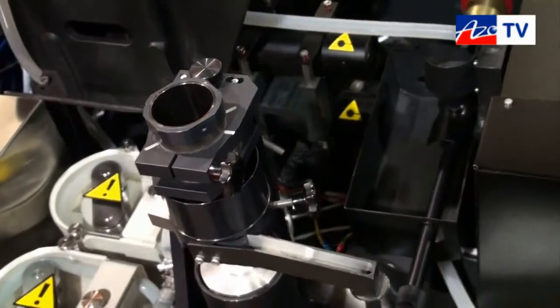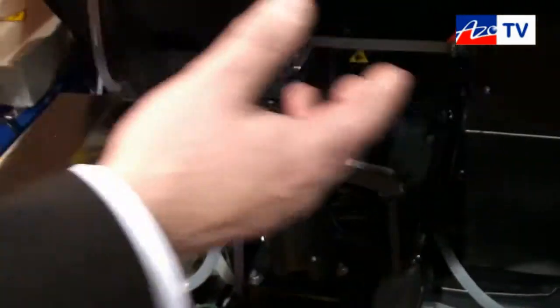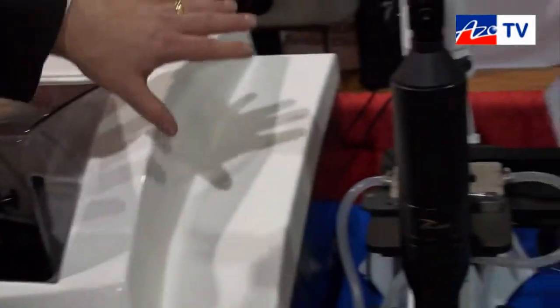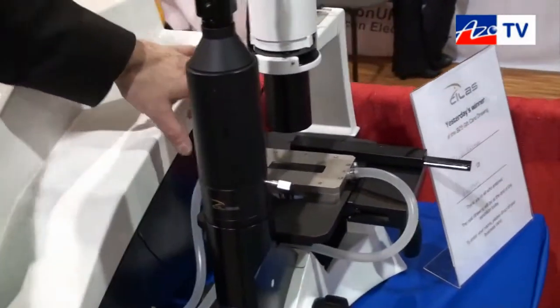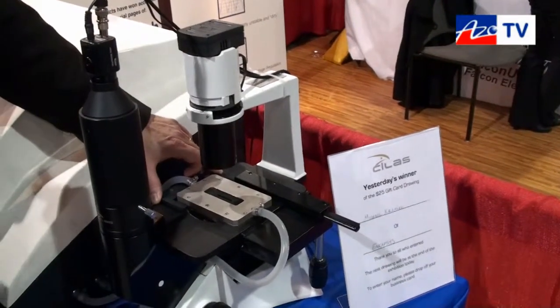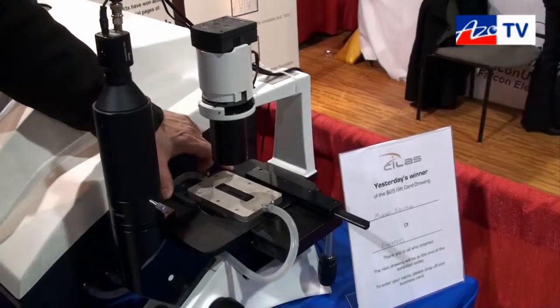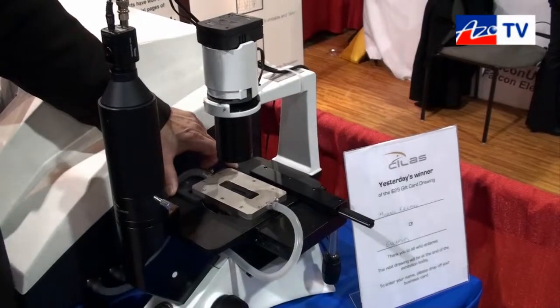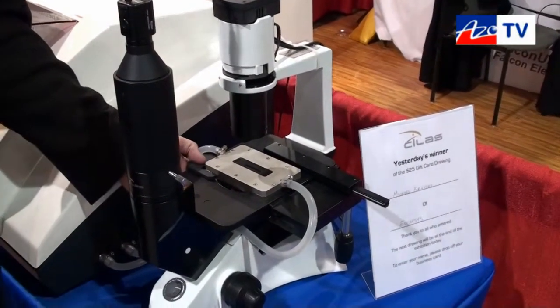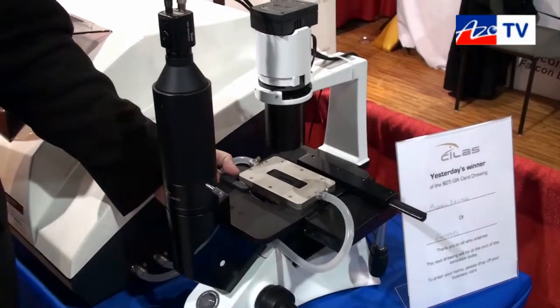That coupled with the image analysis software, and I will close the door to show you a little bit better, is we have an inverted optical microscope capable of looking at particles of less than one micron up to the two and a half millimeters of the same range of the particles we have for the particle size analyzer. We use up to four objectives for varying magnifications. This is a permanently calibrated microscope that we're able to set the focus and collect the images.